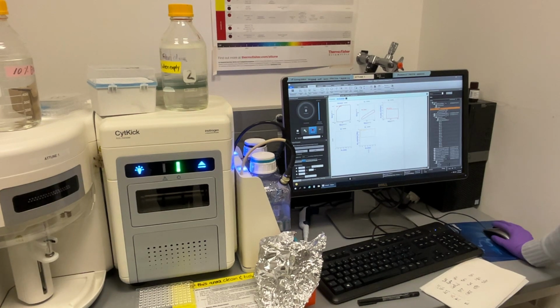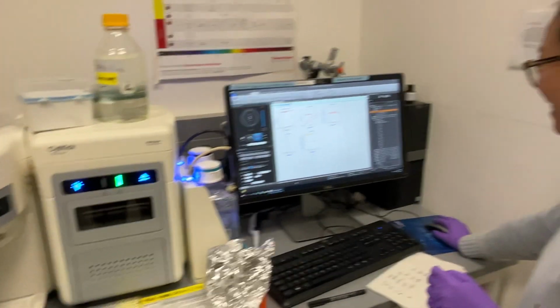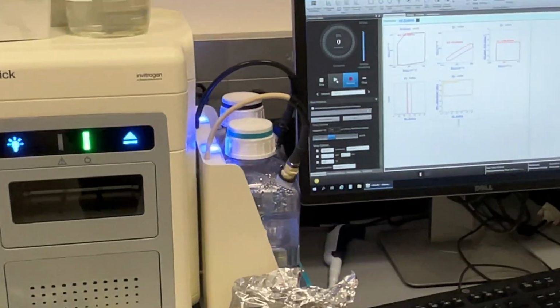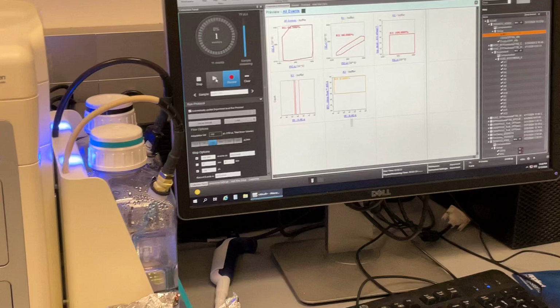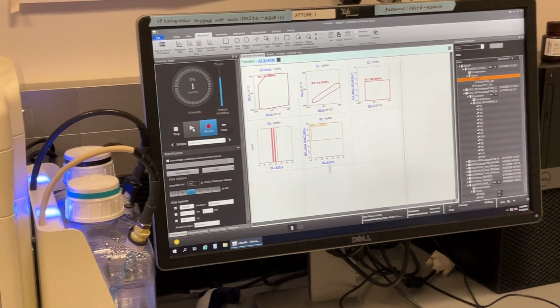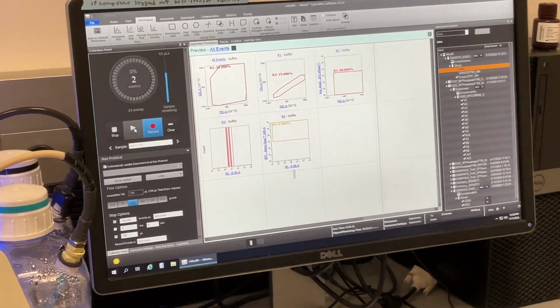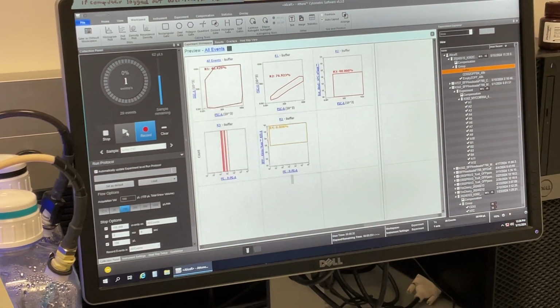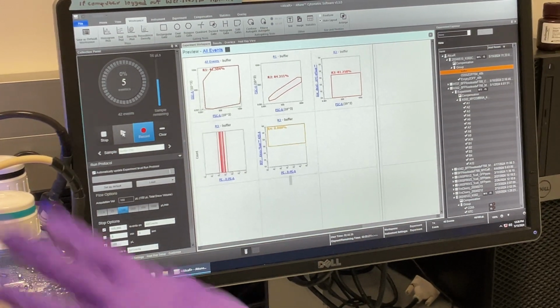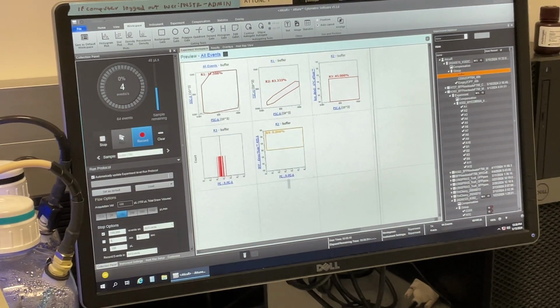Yeah, you can go back and research it and do it yourself. Okay, so this is the clean buffer, which is why it needs to be empty. This is just any buffer that is on there. I just want it to flush through any of the cells.